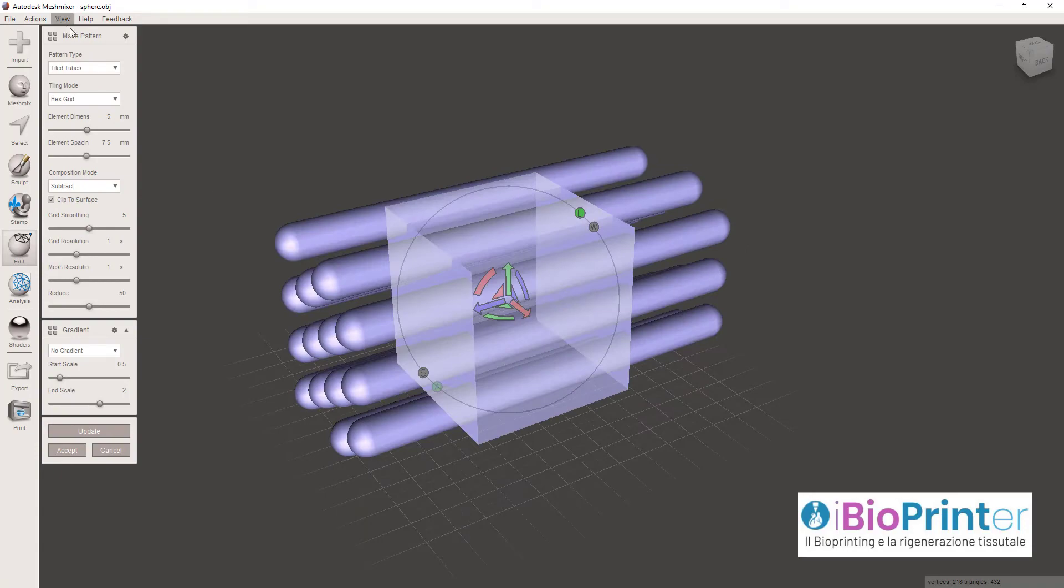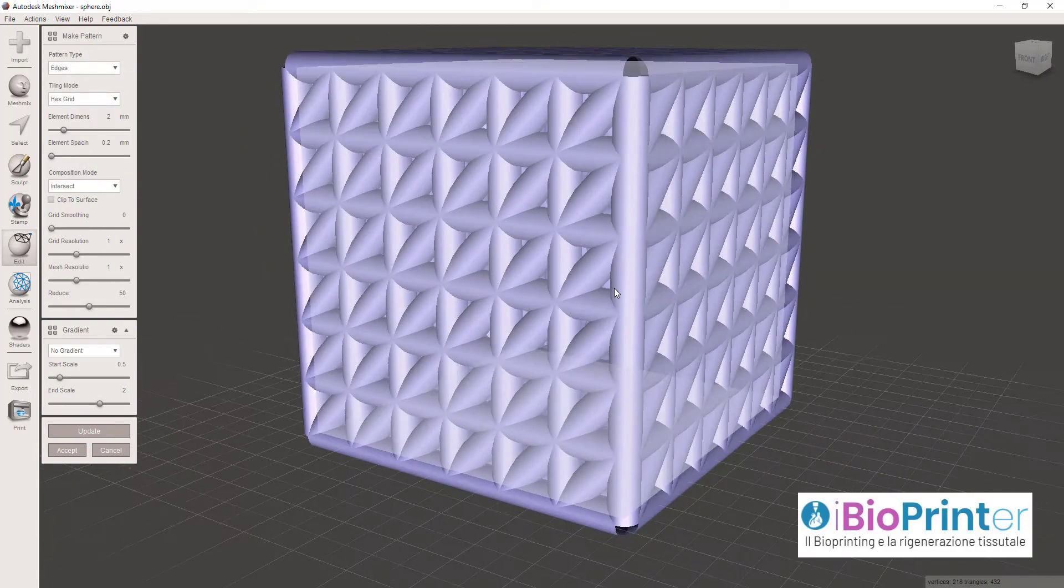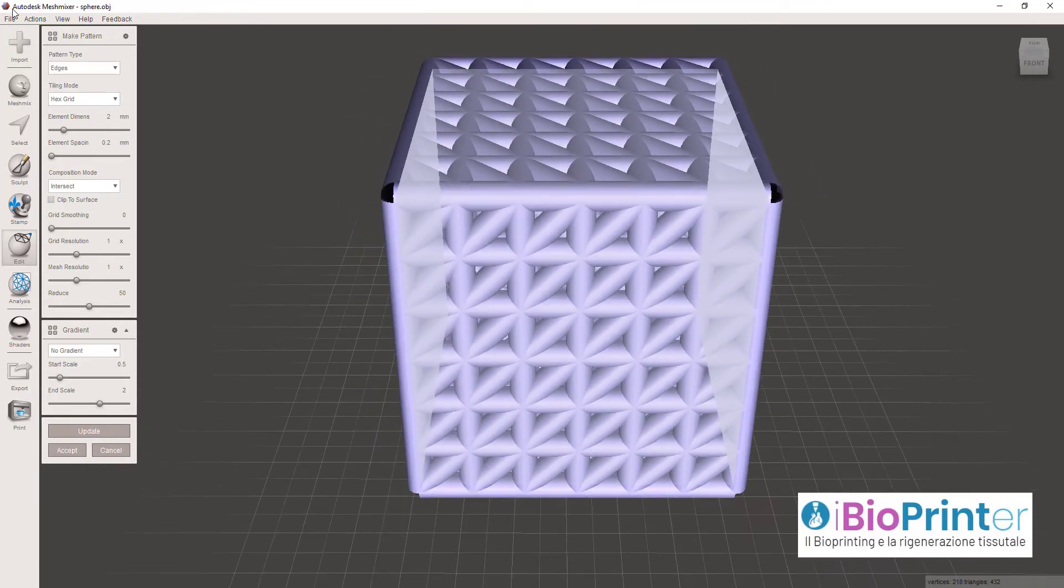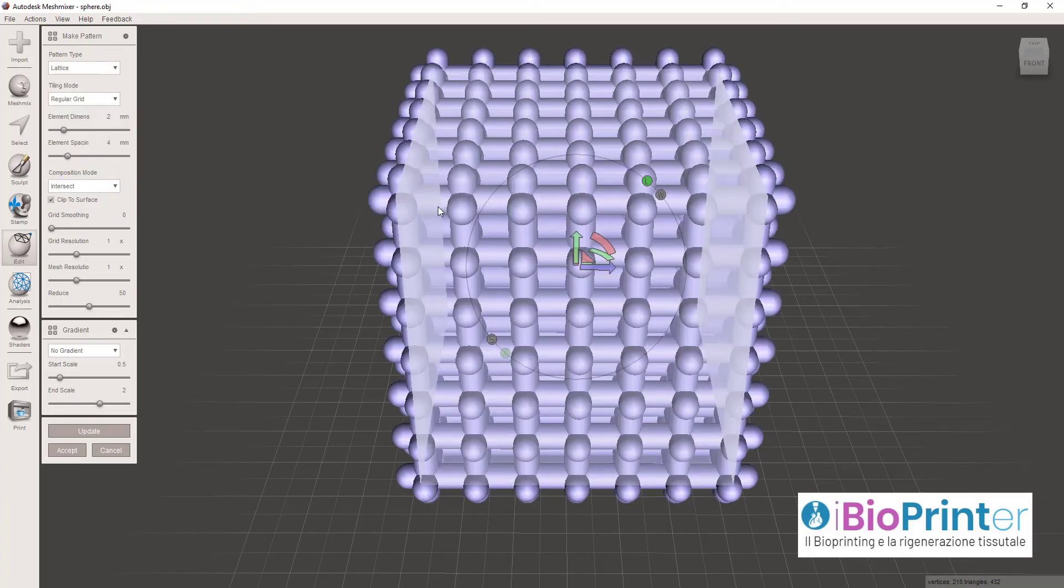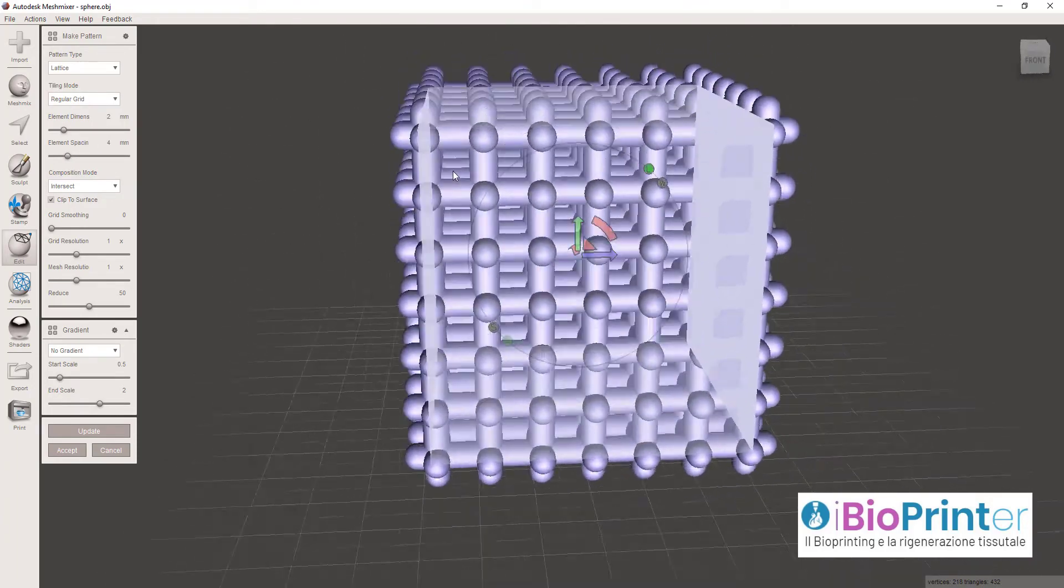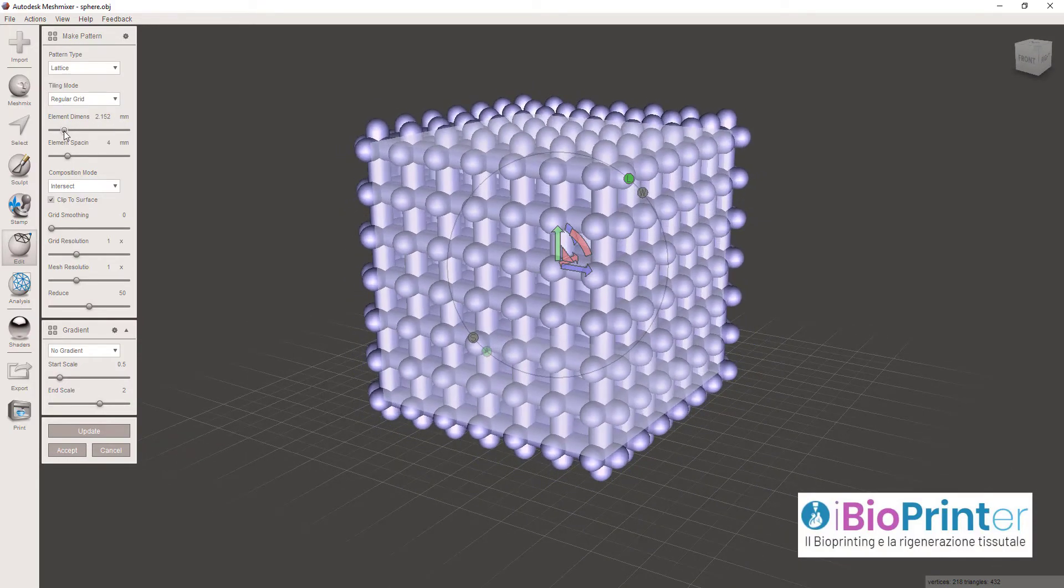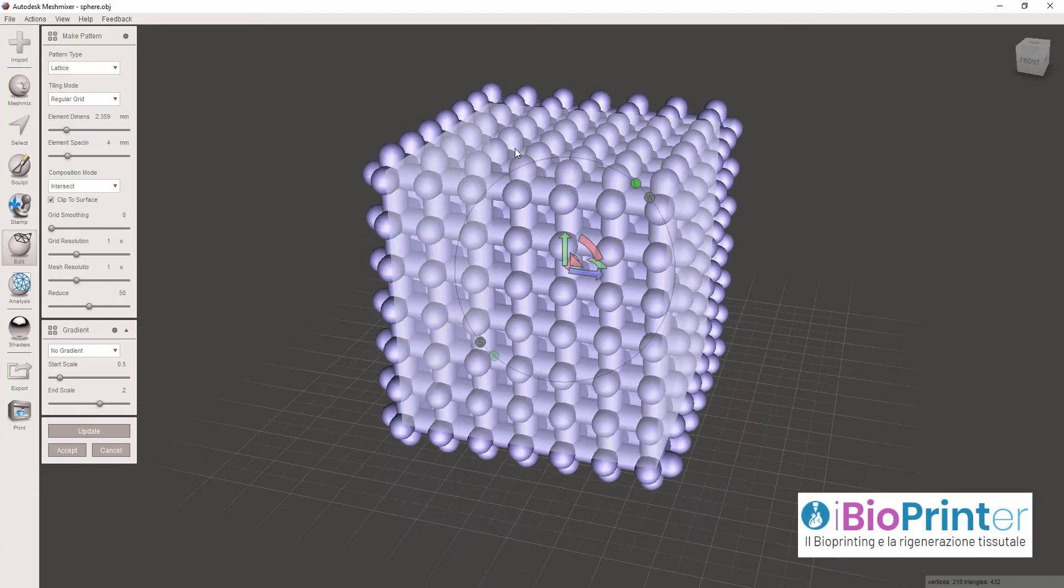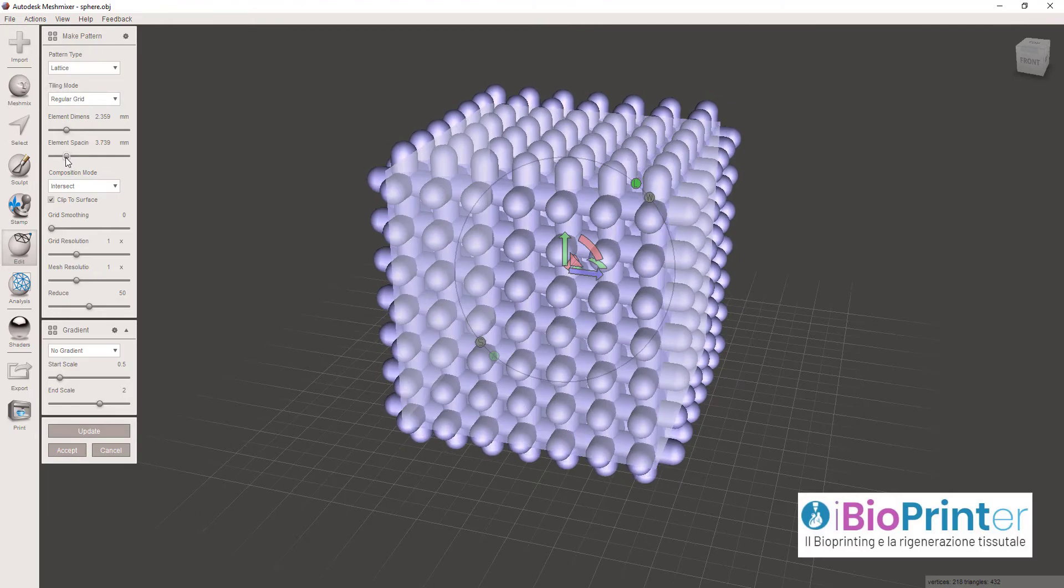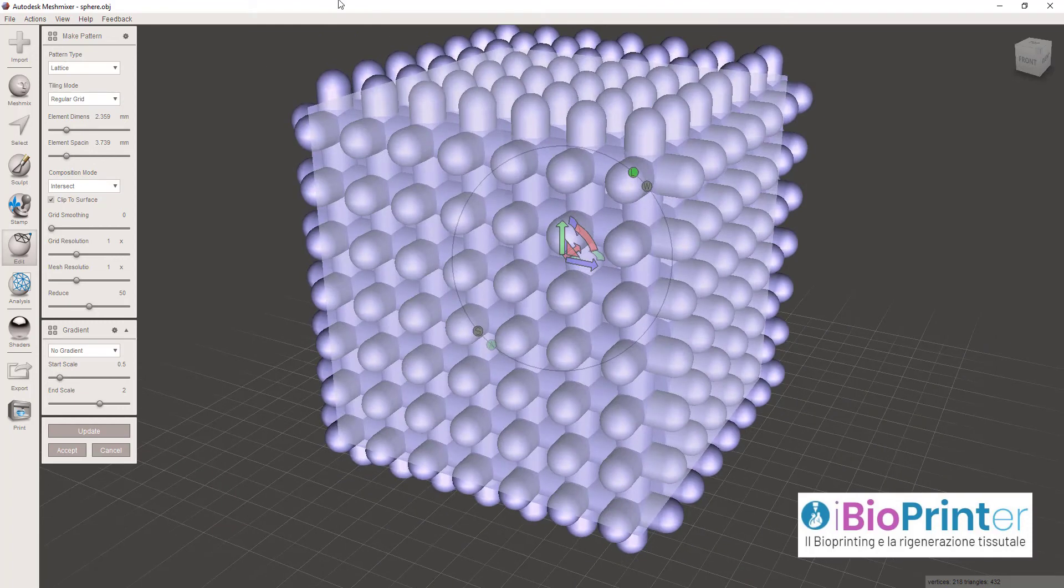Nella sezione Pattern Type ci sono vari tipi di geometrie che potete assegnare al cubo, ad esempio la geometria lattice. Questa può essere modificata attraverso l'aumento o la diminuzione di parametri, come la dimensione delle strutture lineari, oppure la spaziatura tra gli elementi elementari.